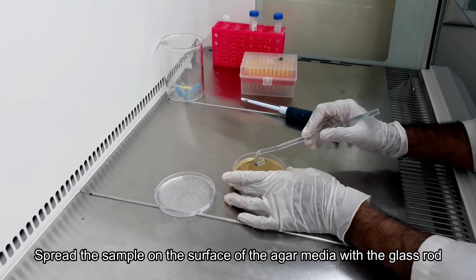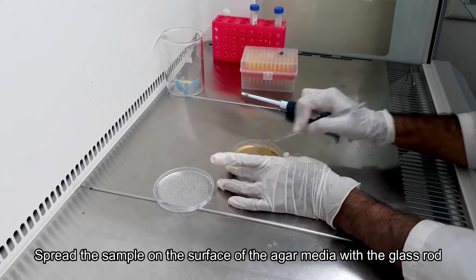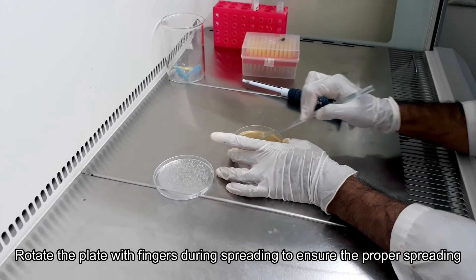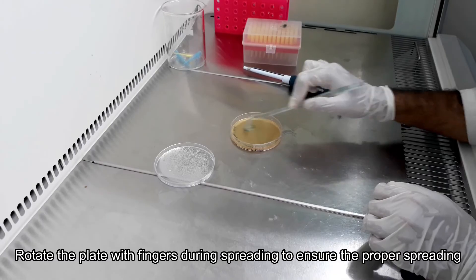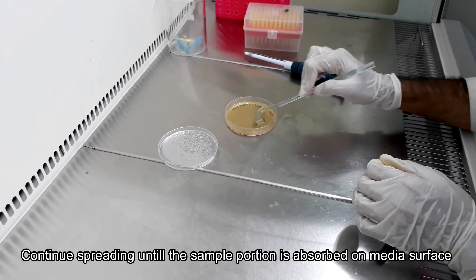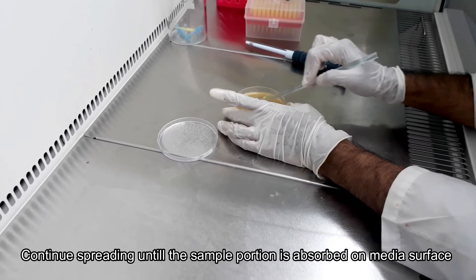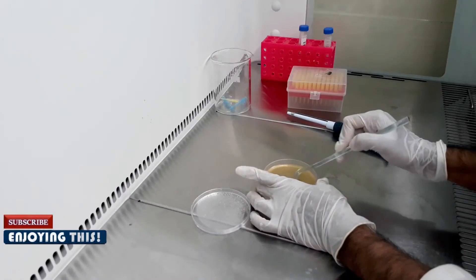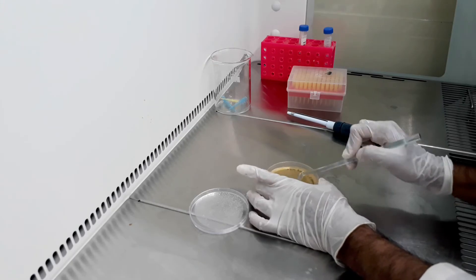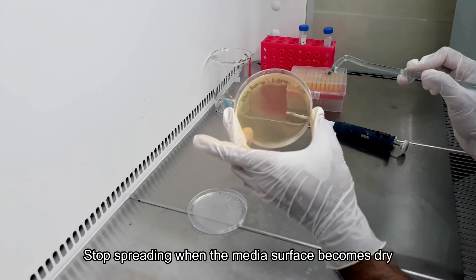Start spreading the sample on the agar media surface and rotate the plate with your finger periodically during spreading to ensure proper distribution. Continue spreading until the sample portion is absorbed on the media surface. Stop spreading if you feel that the media surface is dried up.